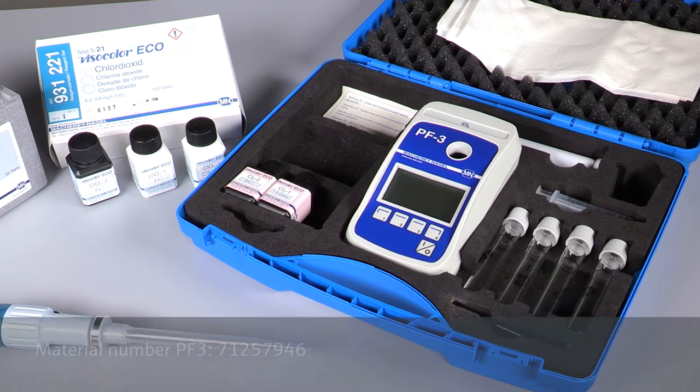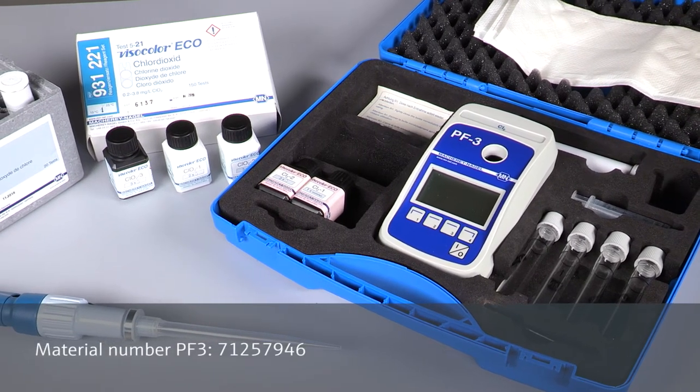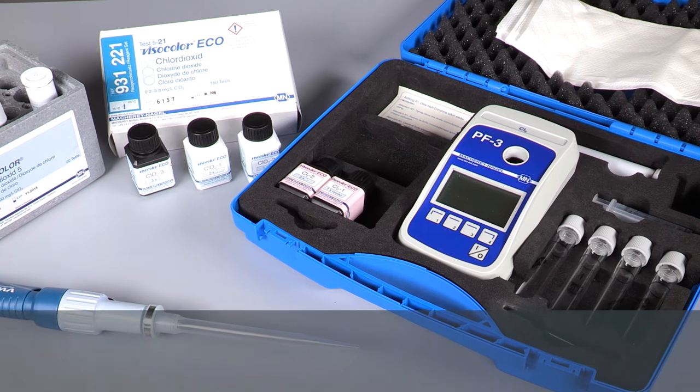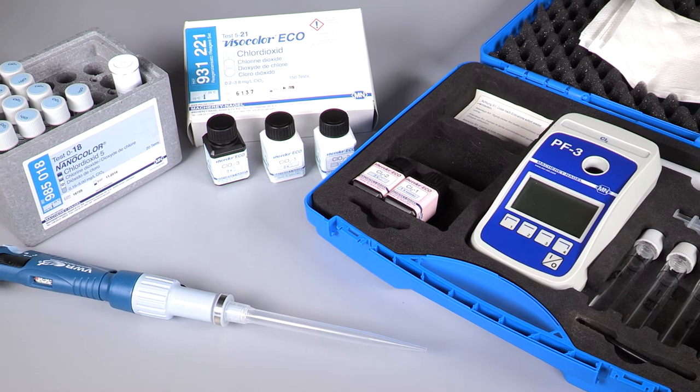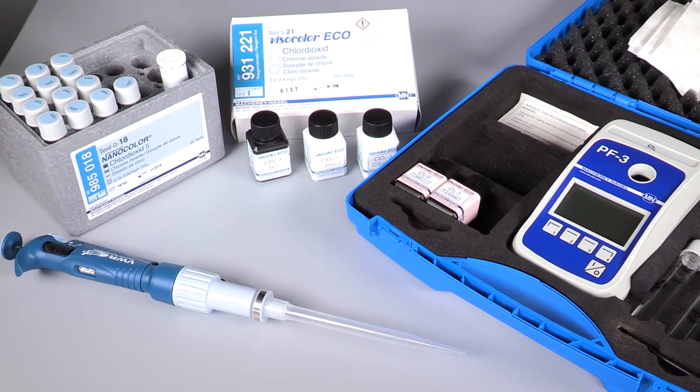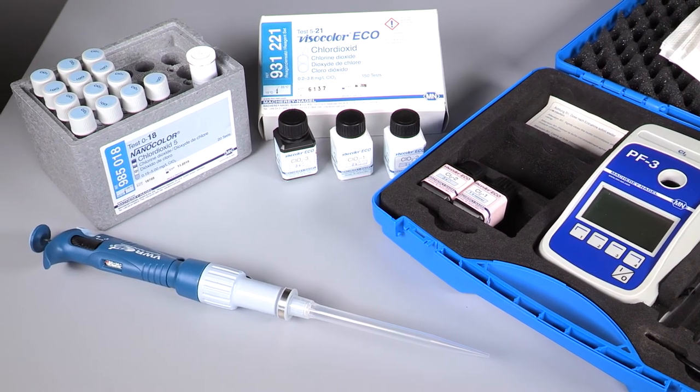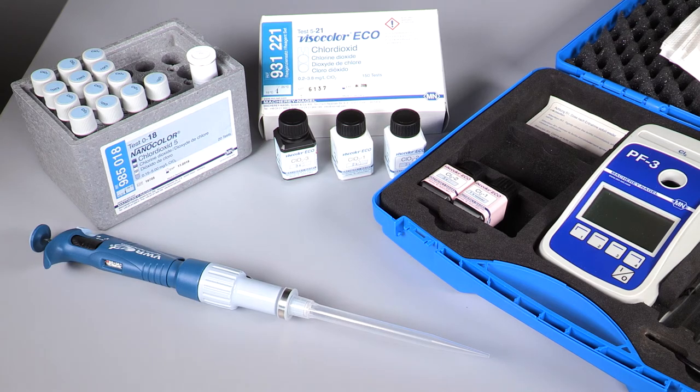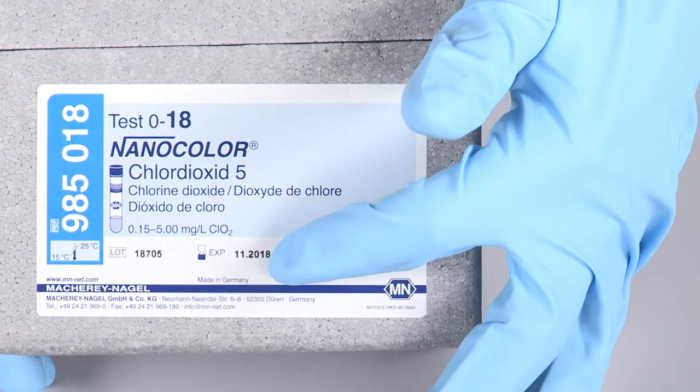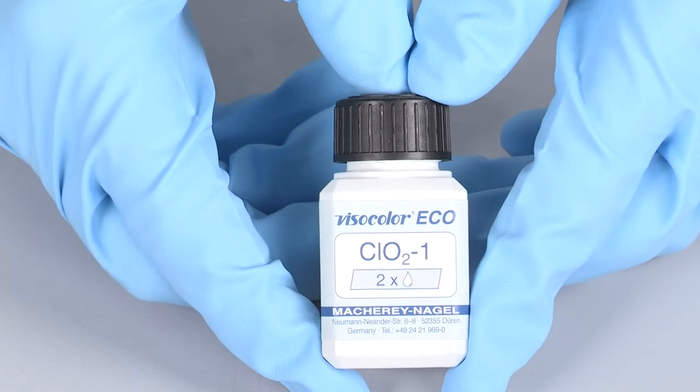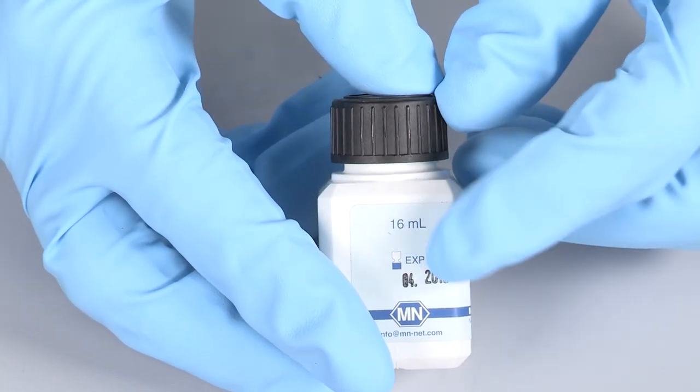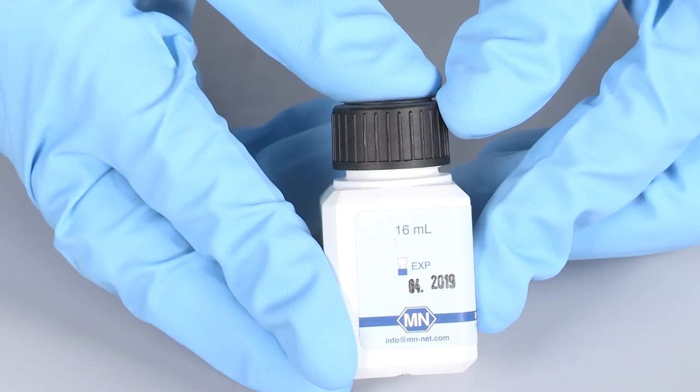Analyzing the Chlorine Dioxide concentration of the sample is done offline with a colorimetric measurement according to the DPD method. Therefore we need a portable photometer, cuvettes and DPD reagents or a ready-made cuvette test. The reagents have a limited shelf life so please check the expiry date before you start with the calibration. In this video we will show you the procedure with the cuvette test.